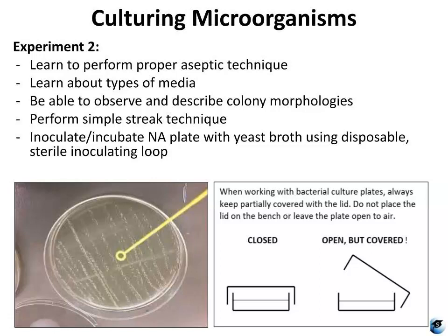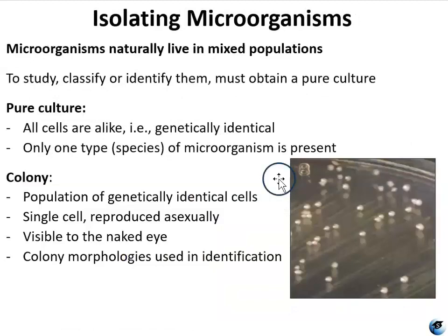Instead of rolling like you did with the swabs, you're just going to rub the loop very gently across the top surface of the agar. And be sure, as always, to use proper aseptic technique through all of these steps. Keep your plates covered, keep your specimen at arm's length, and keep the broth covered as much as possible, all of those things that we discussed earlier. Then after the culture is allowed to incubate, you'll come back and describe the results, including colony morphologies and whether you had contamination and the like.